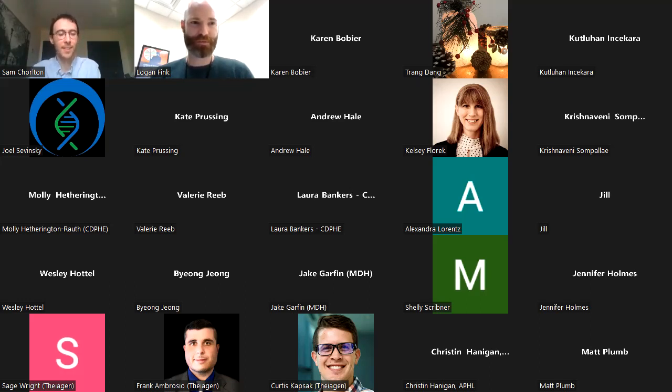That's accurate, yeah. We know that any kingdom of life causes public health problems. I'm not talking about humans, but I'm talking about Candida auris, for example, from eukaryotes, which is a really hot topic in public health and also has its own unique challenges. And so we are building specific eukaryotic analyses in there. But the general framework, if you're going to do assembly and classification, can work whether it's fungal, bacterial, parasitic, which we have some users, and viral as well, which we have some big projects on.